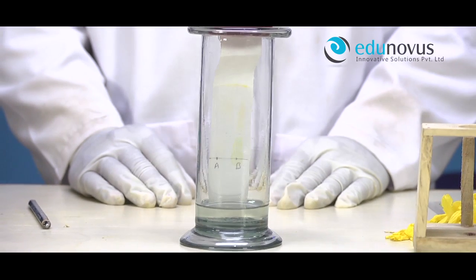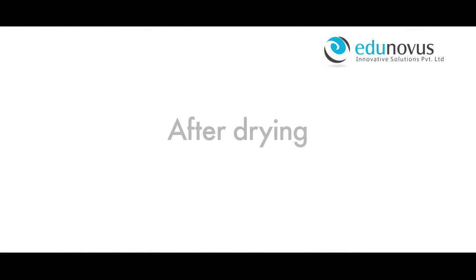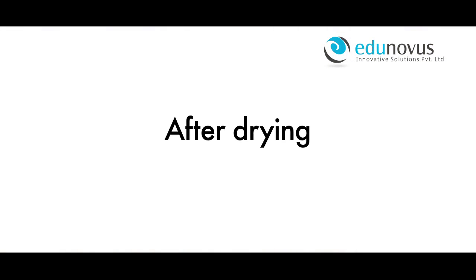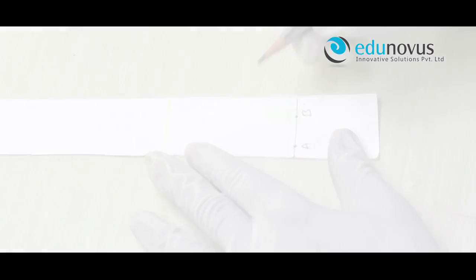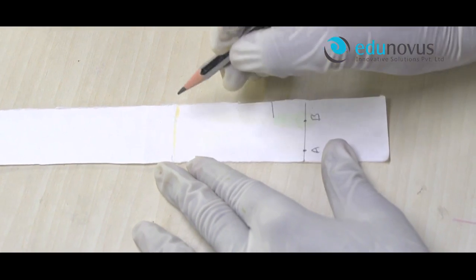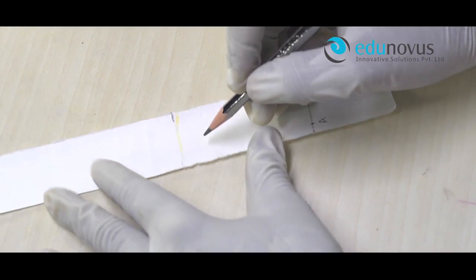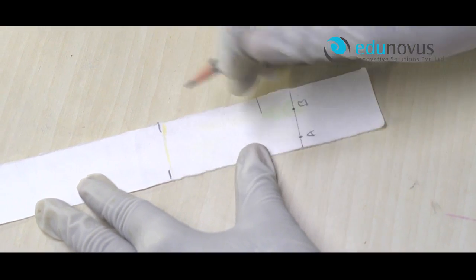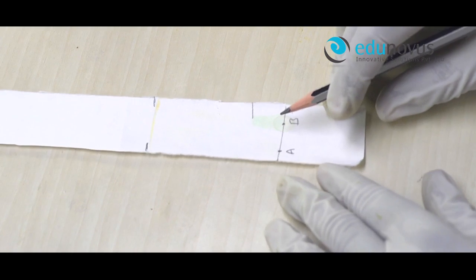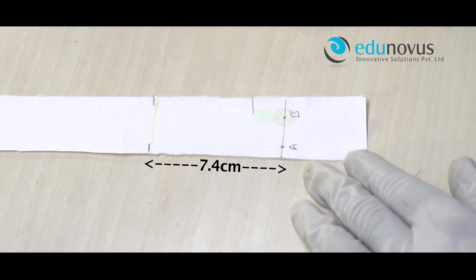Once the solvent stops rising, take the filter paper out of the jar and dry it. Mark the distance that the solvent has risen on the paper. Here it is 7.4 cm. This is called the solvent front.